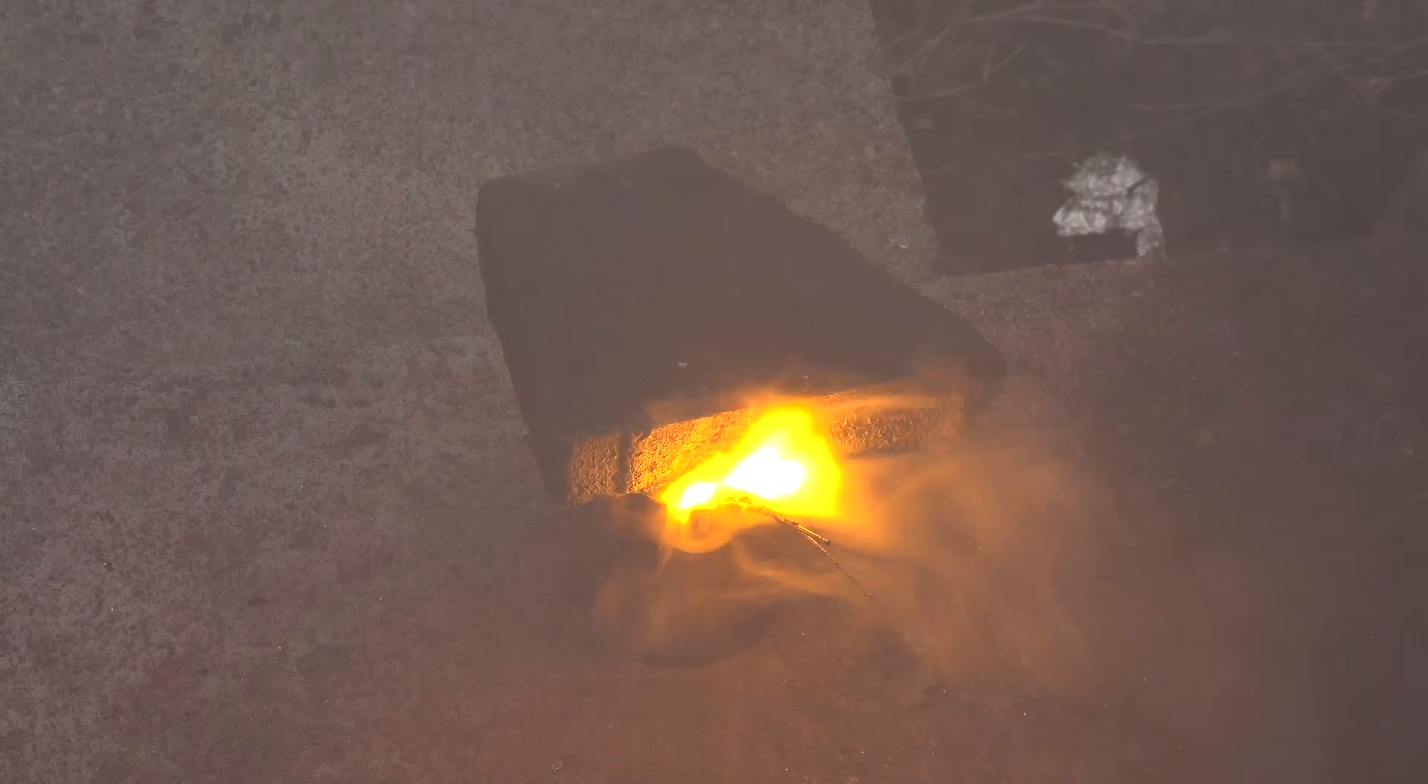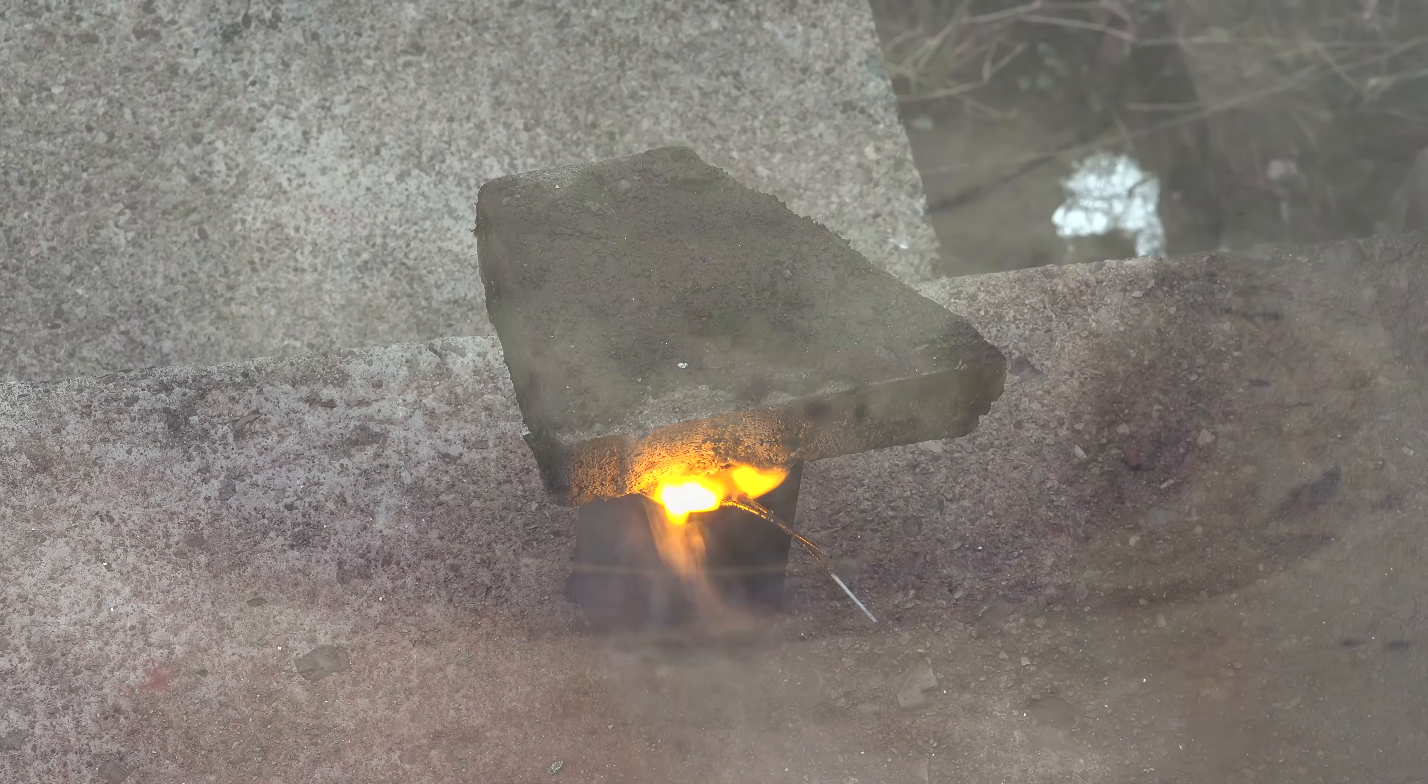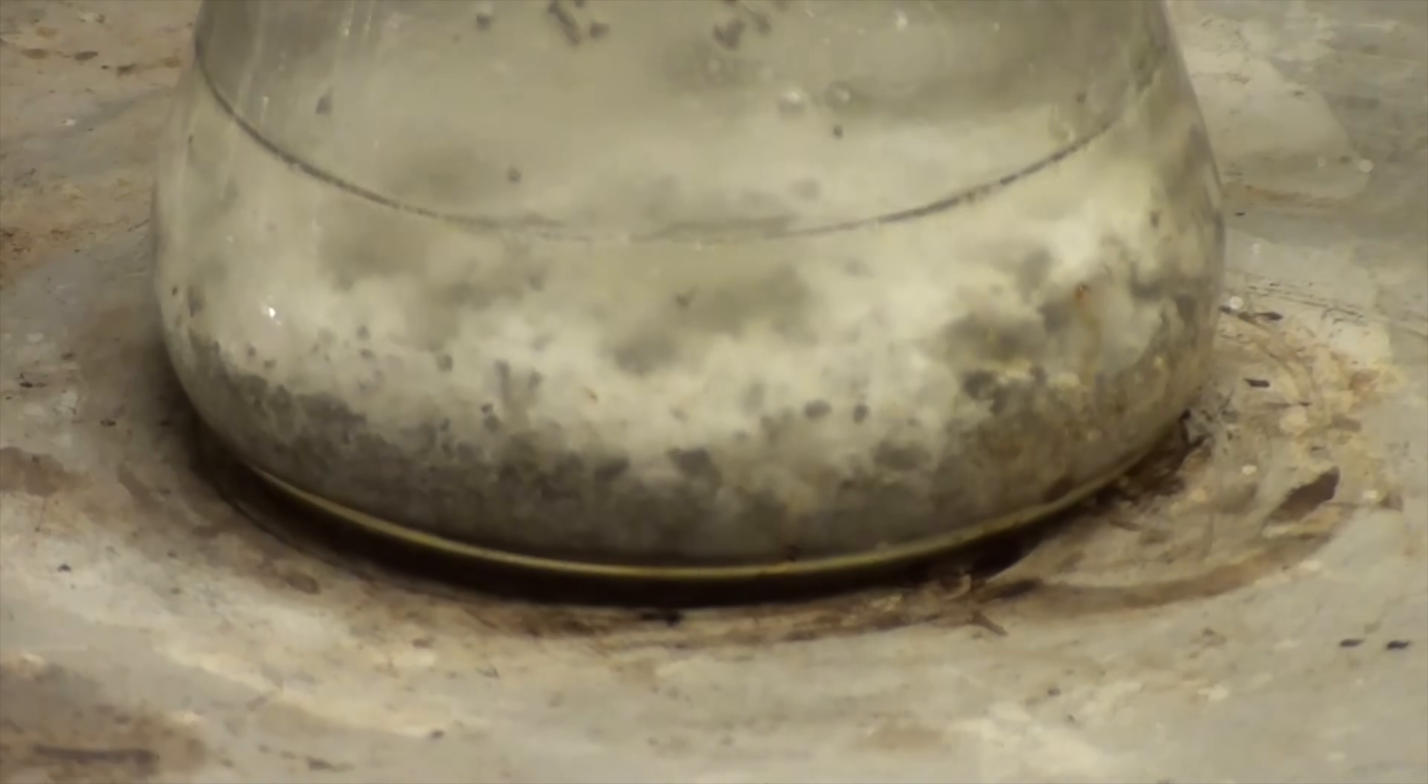This should be safer and higher yielding than the dioxane process which requires an initial high temperature thermochemical reaction that likely burns a lot of the sodium before it can be recovered. That is, if we can get this to actually work.